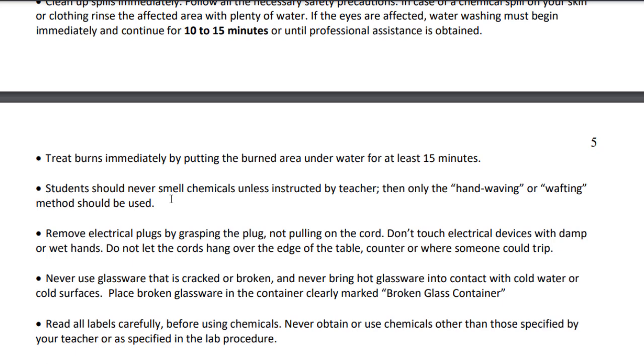Some of these things that you're going to be smelling are very strong, and you're going to regret not wafting. Let me tell you, it'll burn the lining of your nose. You're going to be very uncomfortable. So make sure that you follow that instruction on our first lab. And again, I'll show you that right before we start the lab.